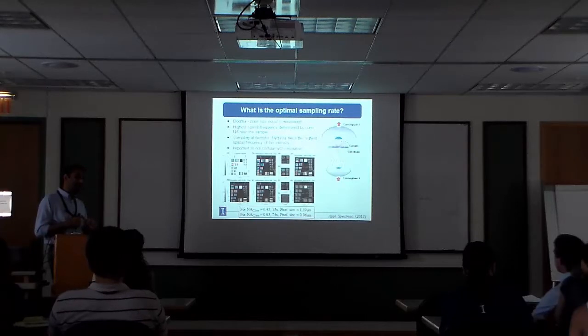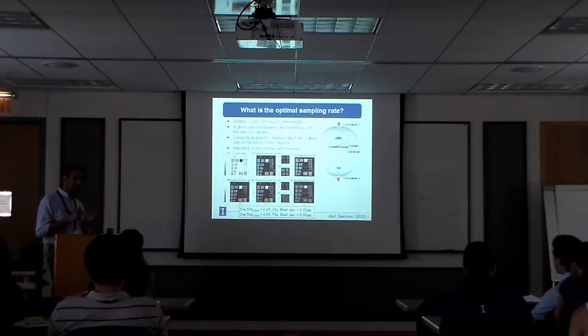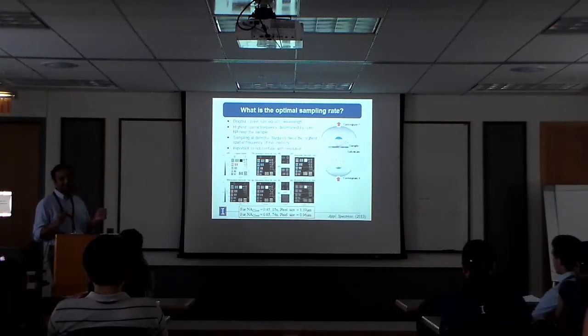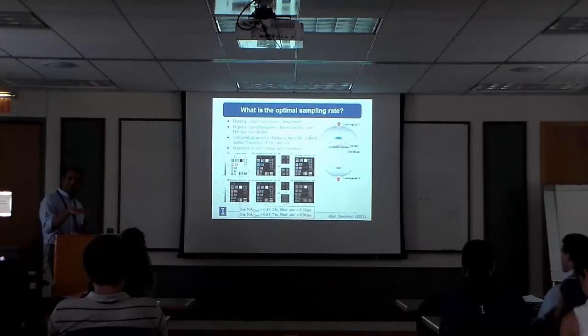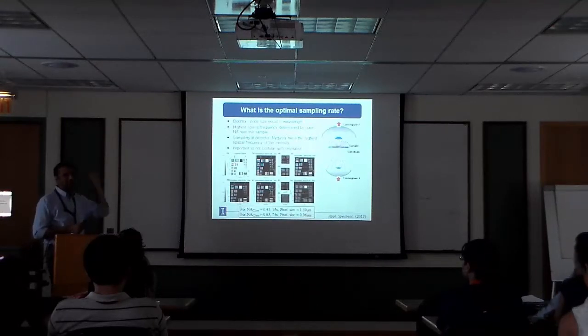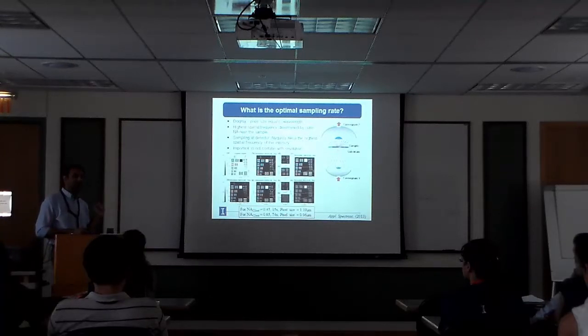This idea of separating overlapped signals in spectrum is actually quite similar to the idea of separating overlapped signals in time, right? So if you've heard of PALM STORM, the sort of super resolution fluorescence microscopy systems, what they do is they excite fluorophores, but only one is activated in a focal volume at one time, right? In the next shot, another one is activated. So if you had things that were spectrally distinct, you could do one-shot super resolution, okay?